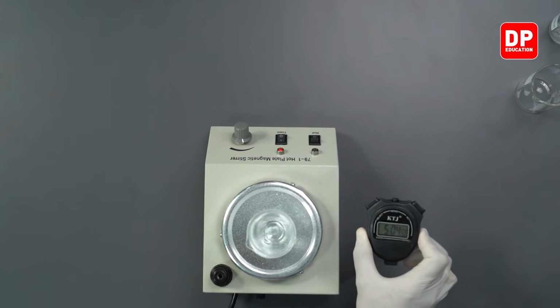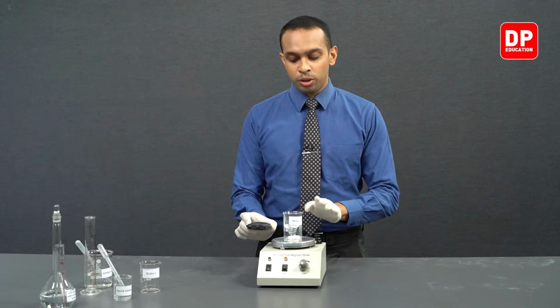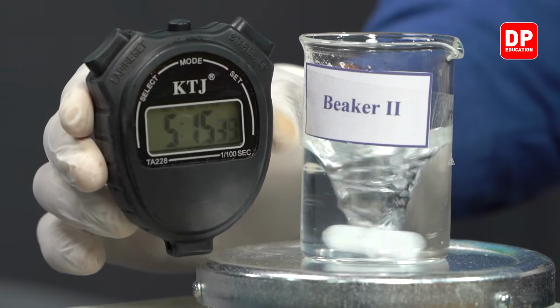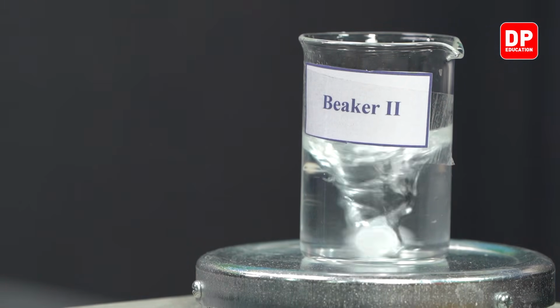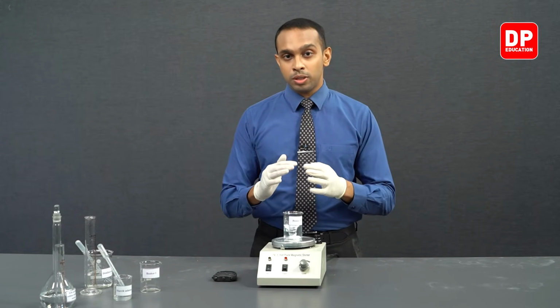Now students, it has been 5 minutes and as you can see, there is no color change. This indicates that the potassium iodide, when reacted with Fe3 plus, produced iodine.